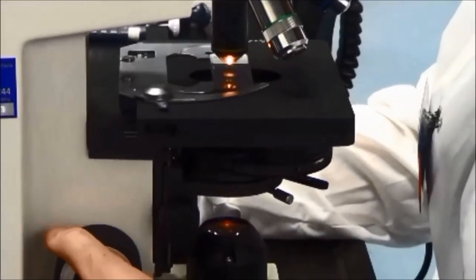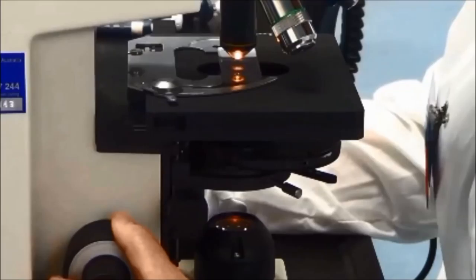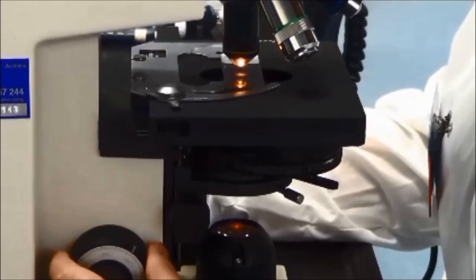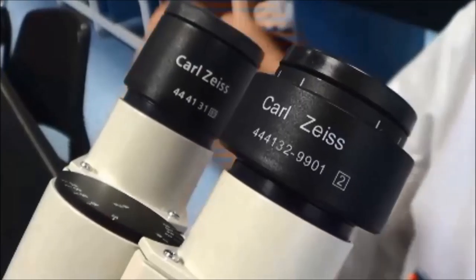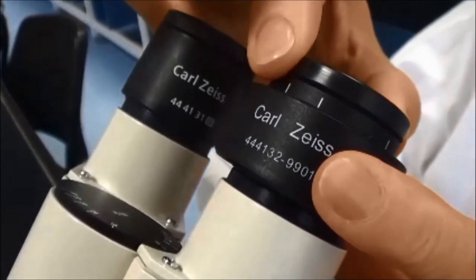First, look through the fixed ocular lens eyepiece, which is on the right. Focus on the specimen using the coarse, then the fine focus knobs. Set the focus for the other eye by turning the lens of the focusing eyepiece if necessary.